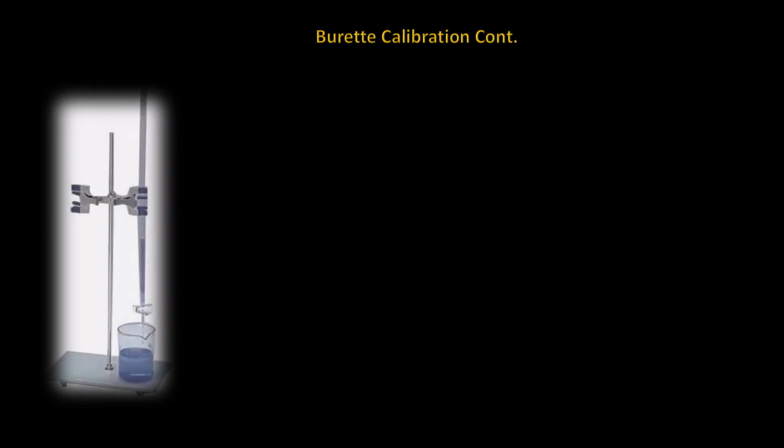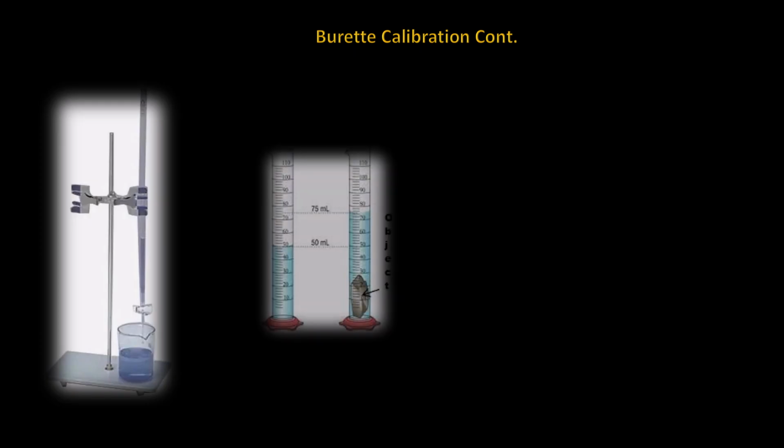The first step is to determine the density of the calibration weight used to calibrate the lab scale. Enough distilled water is added to a clean graduated cylinder to completely cover the calibration weight when added, and the volume is recorded. The weight is then added to displace the water in the graduated cylinder and the volume recorded. The difference between the two recorded volume measurements is the volume of water displaced.